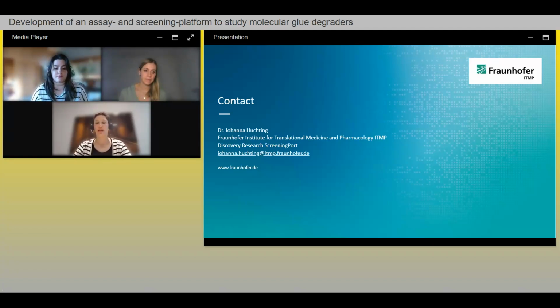You could add lysis buffer to the treatment medium and not remove any of that. We typically don't do that because in general, we want to get rid of the compound that's in the treatment medium, because that might have stronger interference with the readout technology, the HTRF in the end. So it's possible to do that, definitely, but if it's possible to just take off your treatment medium, I would always advise to do that, and not just in this setup, but in all kinds of different setups, to really get rid of the compound that's in the medium.